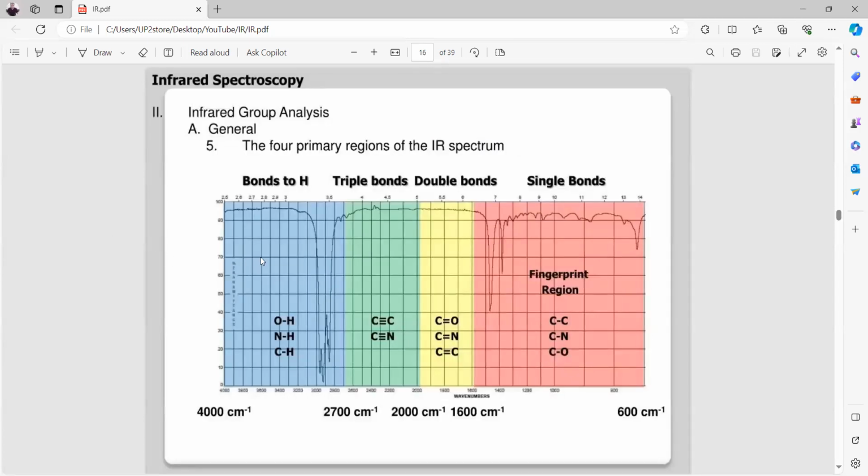To summarize our presentation today, we can analyze a sample, like an organic sample, and we can get the final IR chart, and from the IR chart we can detect many functional groups.